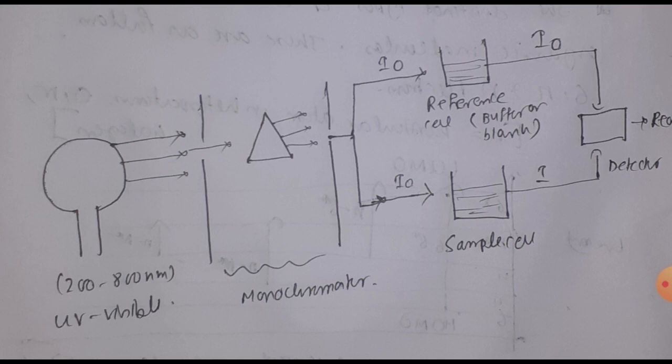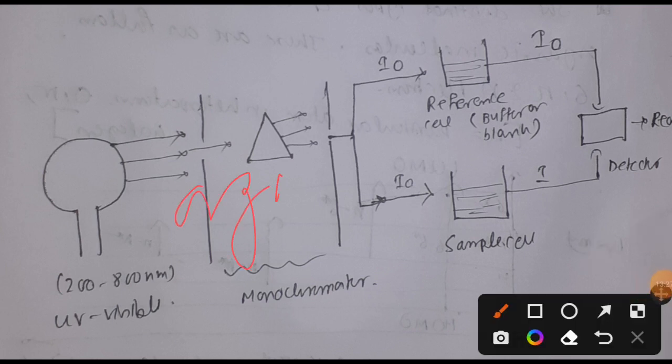Now we are going to discuss the kinds of transition, because remember, as our deal is with organic molecules, organic molecules have three distinct types of electron. One is the sigma electron. Sigma is mainly for single bond containing molecules, for example C single bond C, and pi electrons are there for C double bond C and C triple bond C cases.